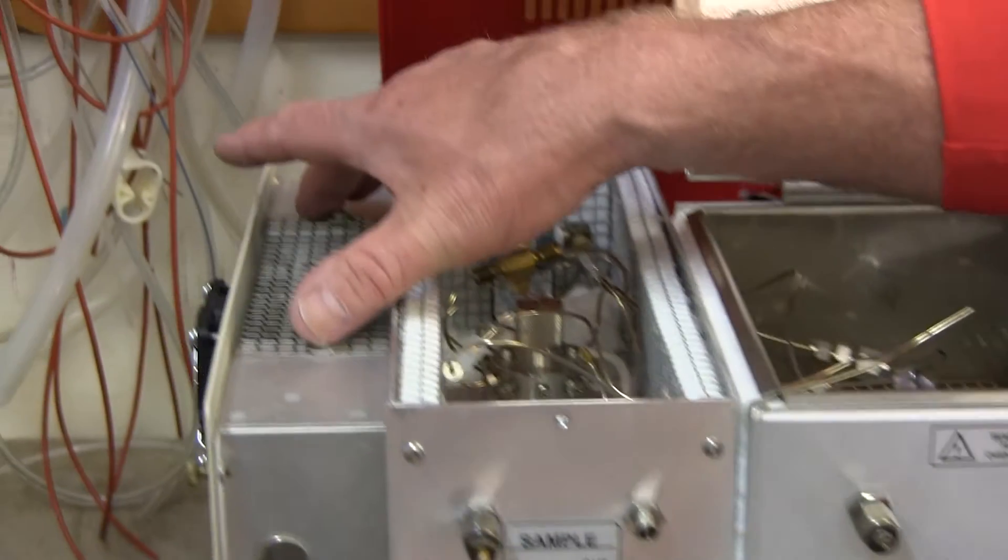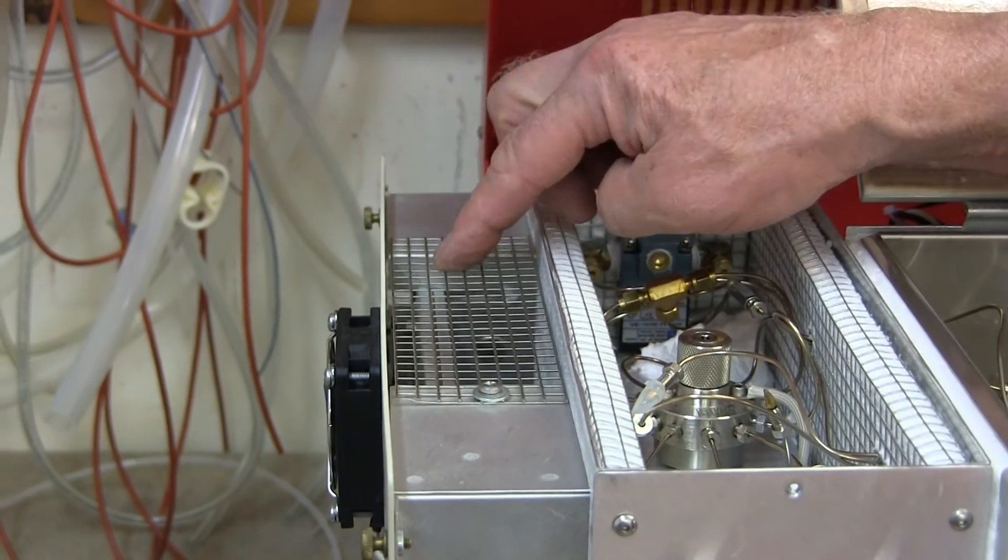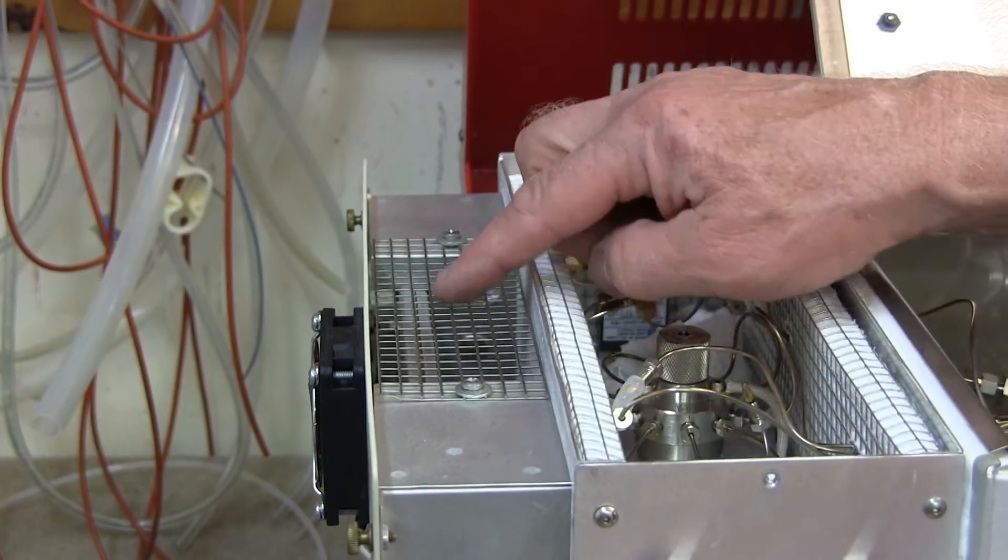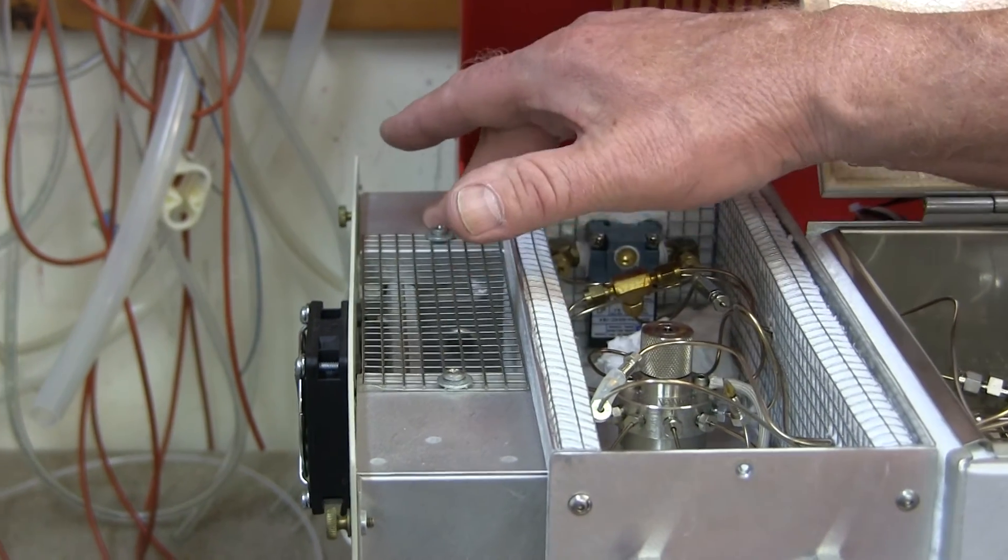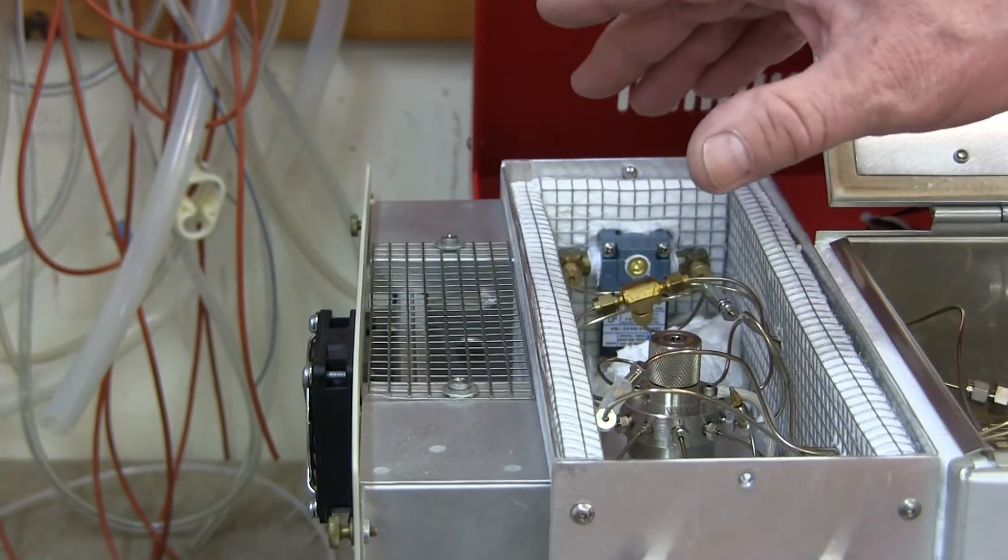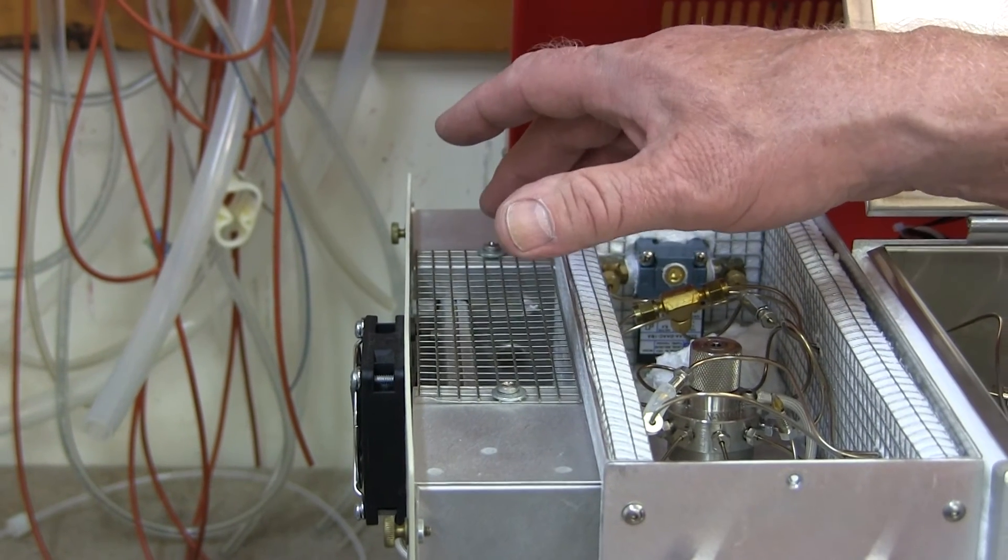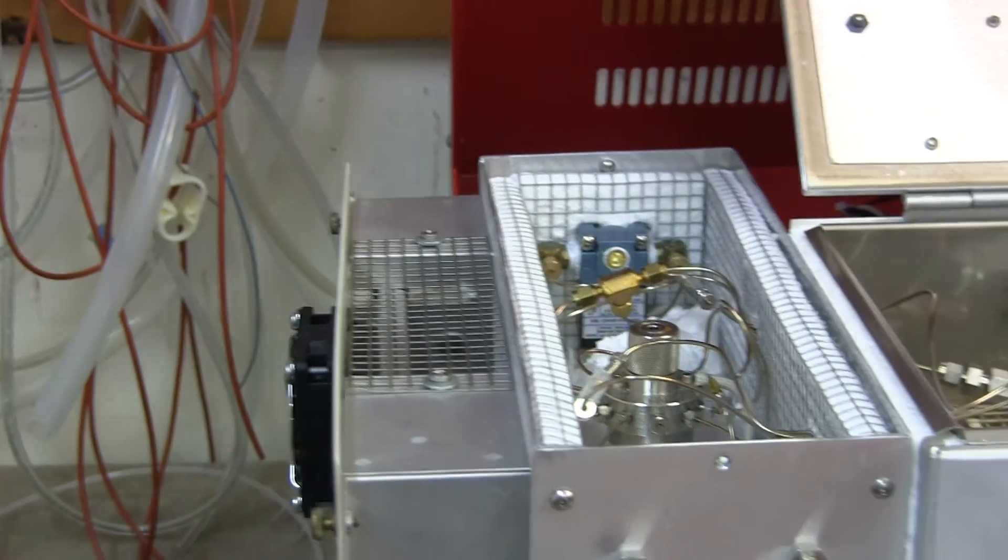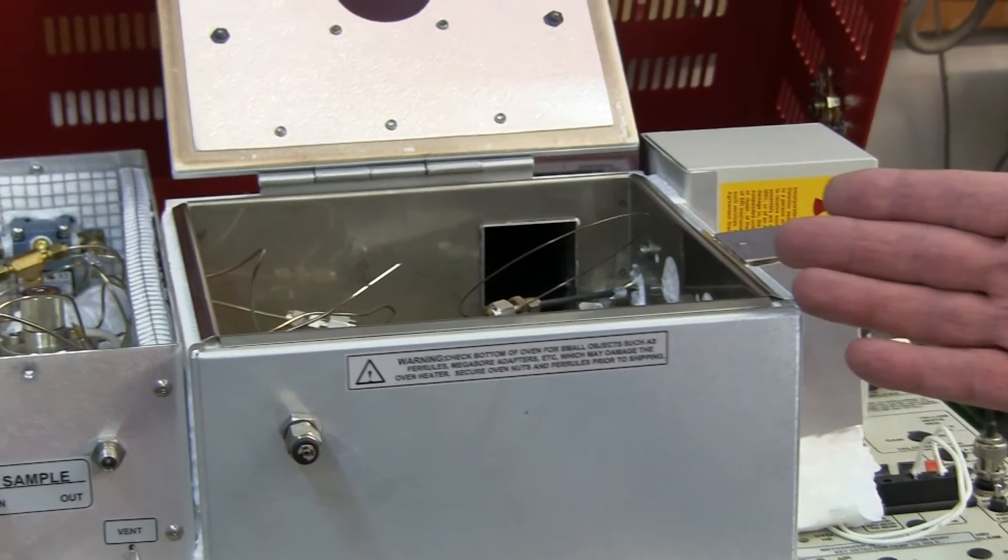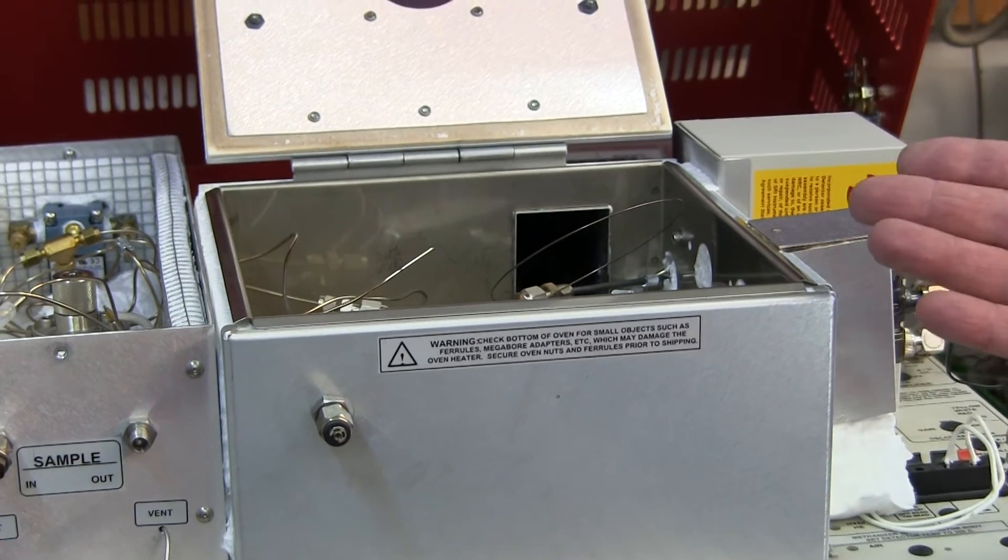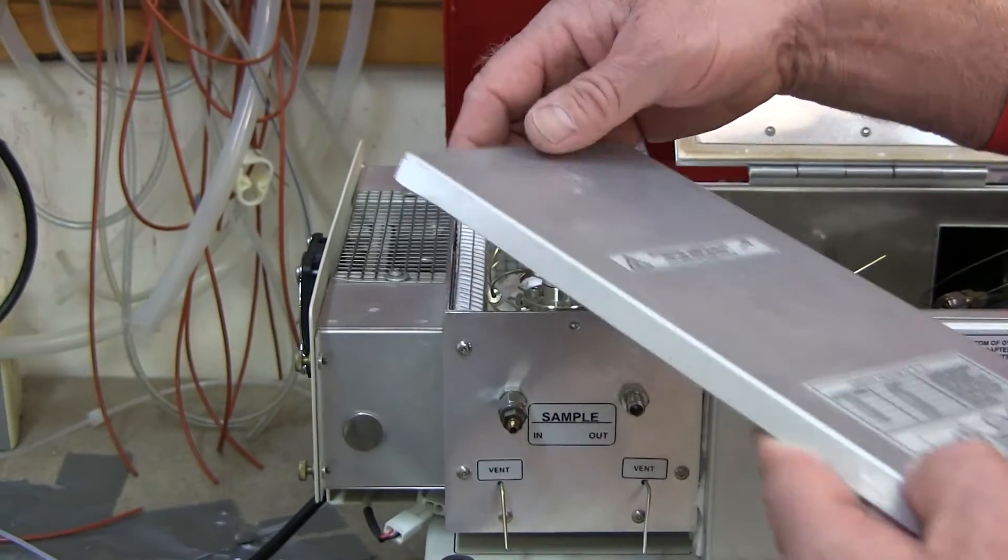This particular GC also has a pre-concentrator, sometimes we call it a trap. It's a tube filled with an adsorbent powder. If you pass a volume of gas through the tube, it retains the molecules that you're trying to measure and accumulates them. Eventually the valve rotates and this heats up and the molecules that are retained on the trap are inserted into the carrier gas and onto the column and then into the detector. This enables you to get detection limits that are thousands of times less than what the detectors would normally be able to see because you're concentrating the sample on this trap and then desorbing it.